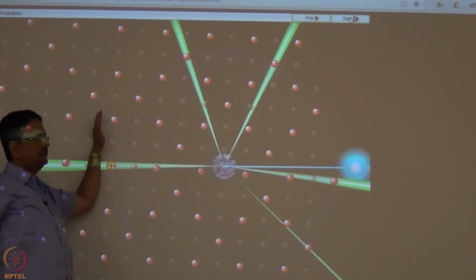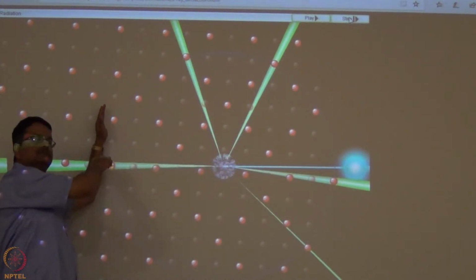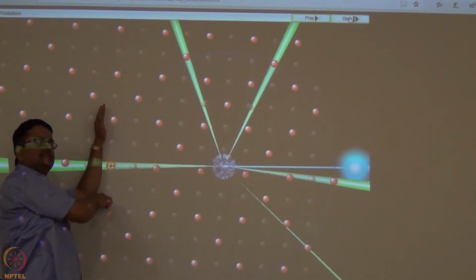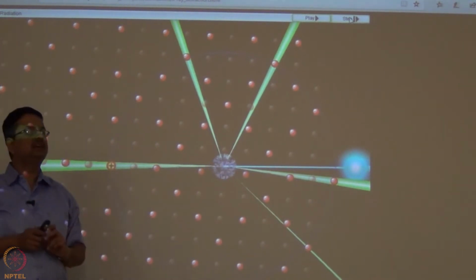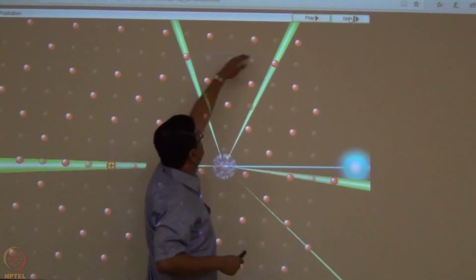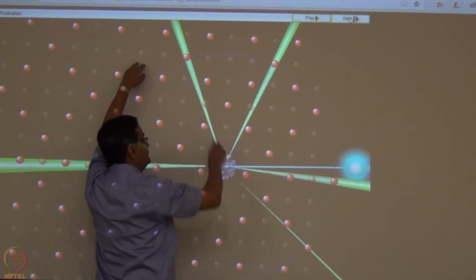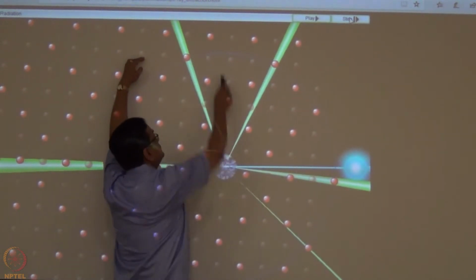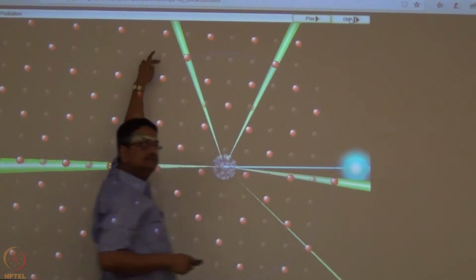If you place the detector like this, straight along the direction of the beam, you get plus 30 to minus 30. So on either side, your maximum 2 theta is 30 degrees. But then, if you have a chance to get the detector somewhere there, when this angle is maybe 90 degrees, the detector is kept there, you record from here to there.